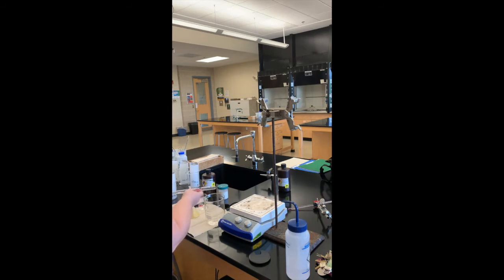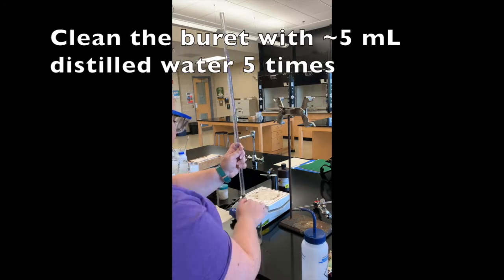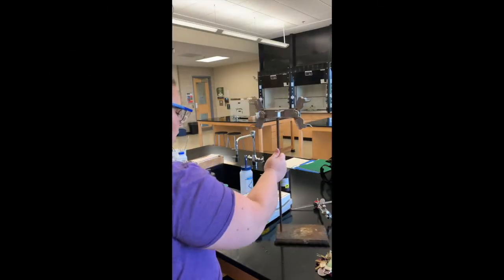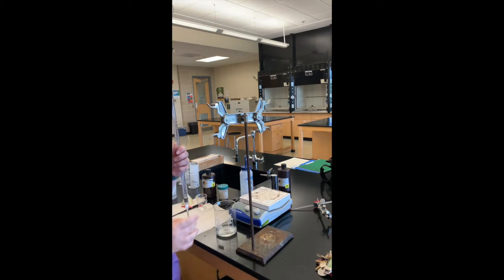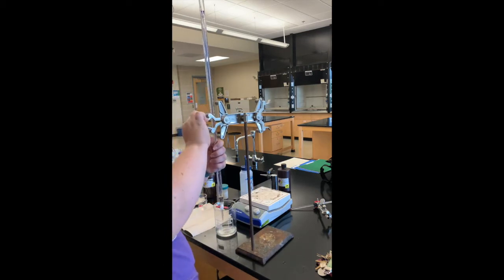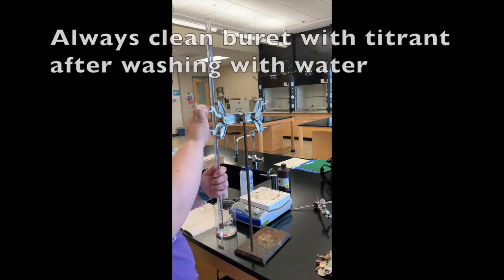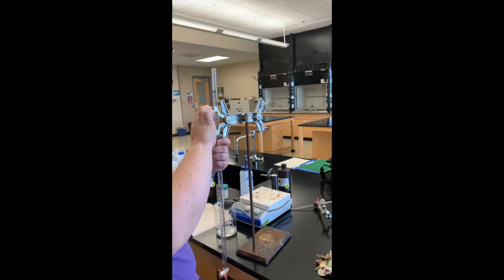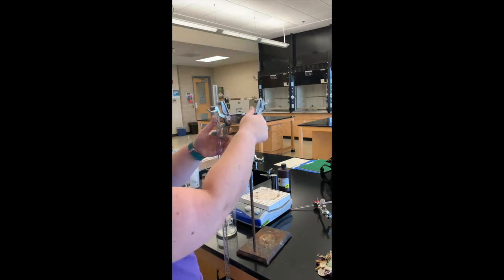Remember that each of these washes should also go through the tip of the burette. Now that I've finished cleaning with water, I want to also clean it with the potassium permanganate so that we don't use a diluted solution while we titrate.